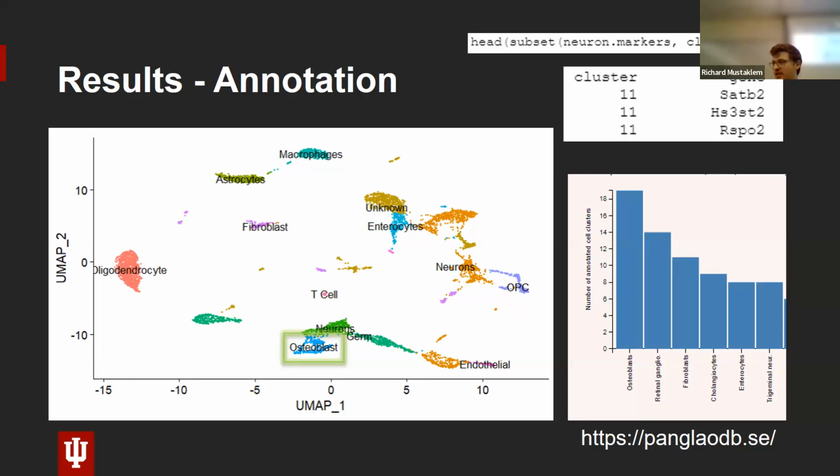This would be really important stuff. Like we would see microglia. Microglia are really correlated to whatever, so-and-so. And you can use this to draw your biological conclusions. And there are many different ways to annotate as well, but this is just how I manually annotate.